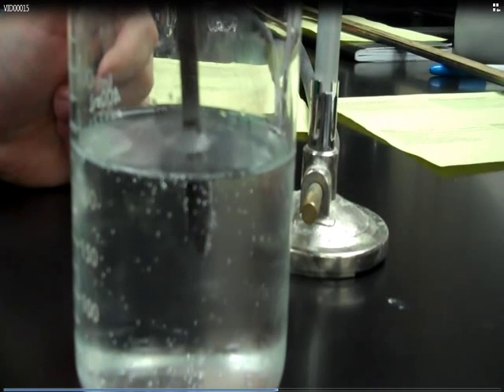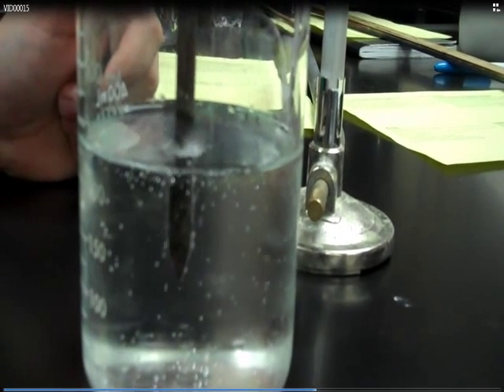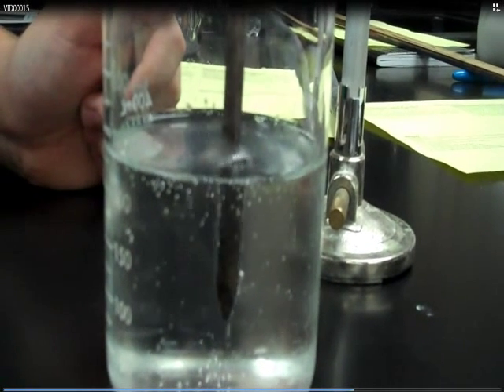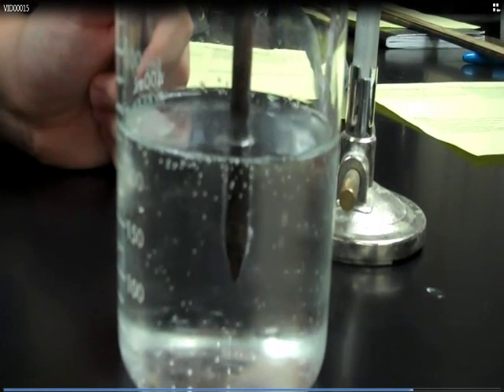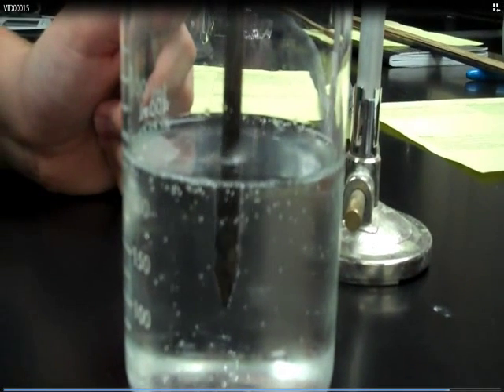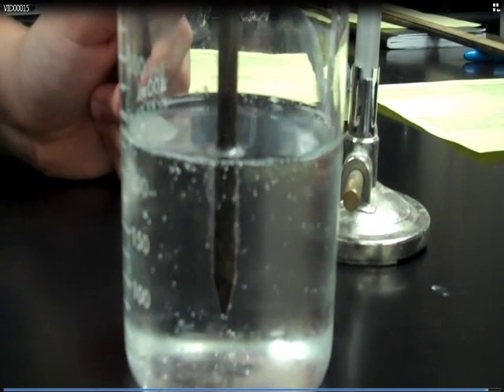Now if we look, we can see bubbles forming on the surface of the hot nail. The bubbles forming indicates that the CO2 is leaving the solution, meaning the CO2 is now less soluble at the higher temperature near the nail. So with a gaseous solute, as temperature goes up, it becomes less soluble. As temperature goes down, it is more soluble. Thank you again, Mason.